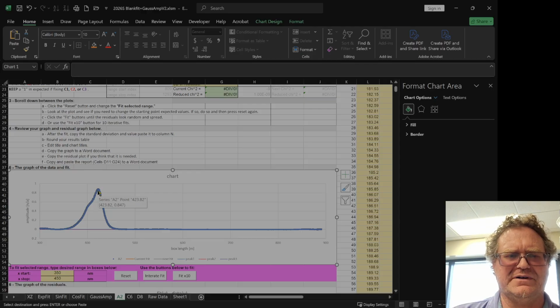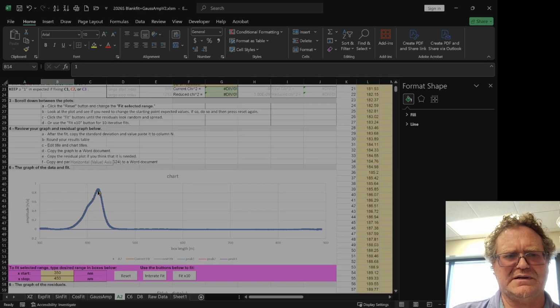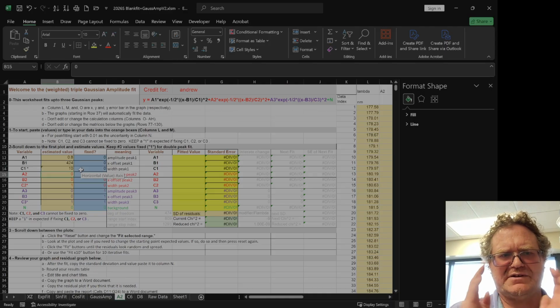And it's 424 and about 0.847, but I know it's going to come down just a little bit, so I'm just going to do 0.8. 0.8 and 424. Now for the width of that, I would come down about halfway, so to about 0.4, and then come over to here for the taller peak, and I see 434 for my X. I would take that number and subtract my previous number. So up here, I would say that's going to be equal to 434 minus the value that I just had for my B. And so that's going to say my half width is about 10.